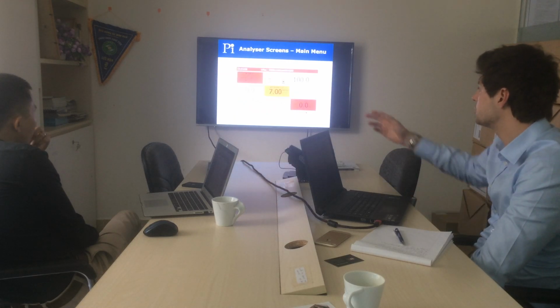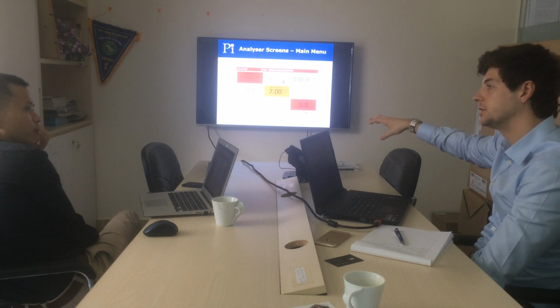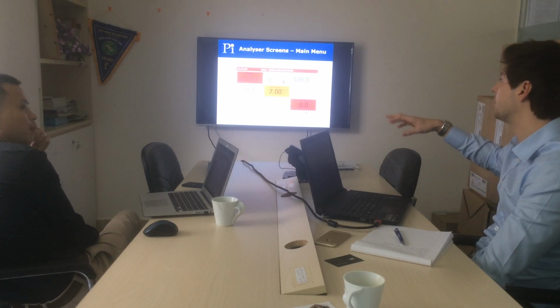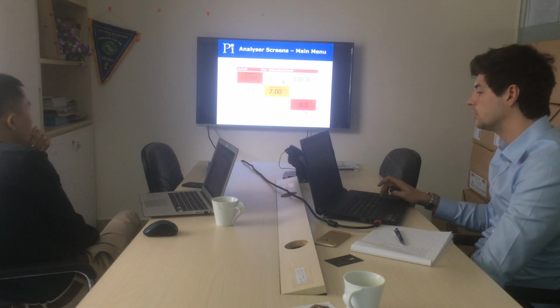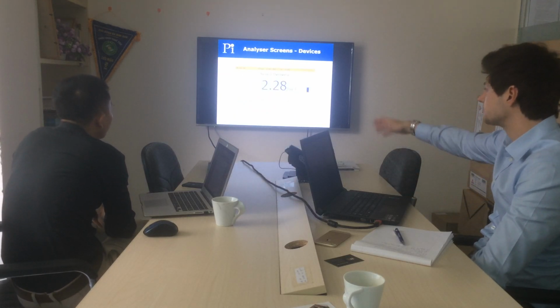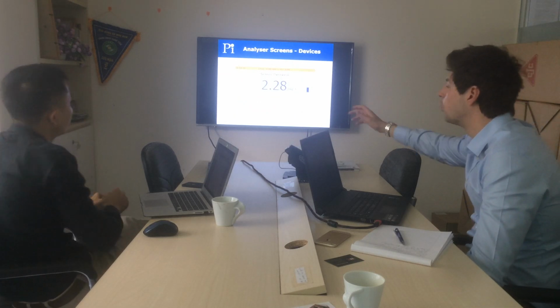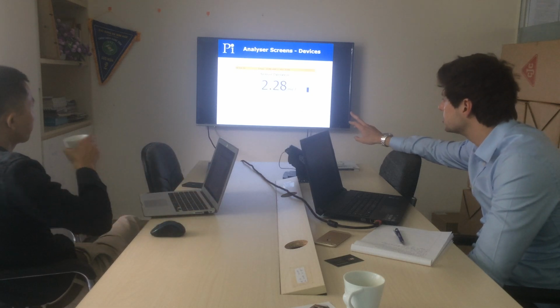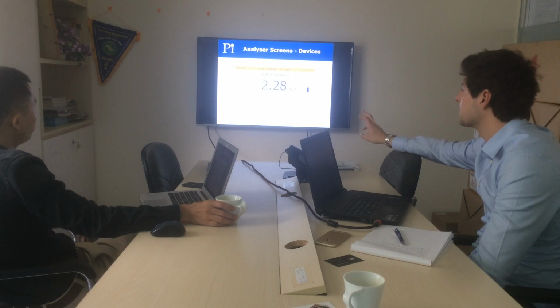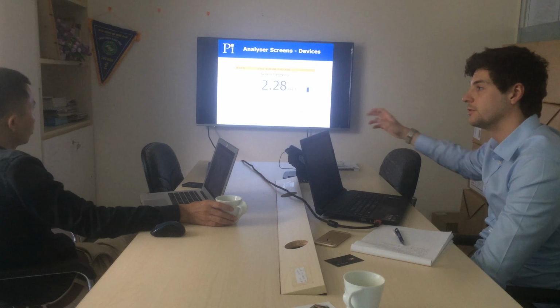And if you click onto a tile, for instance the pH, all of the information is contained in each tile for that section. So all of the information about pH is on the pH tile. If you click on a free chlorine tile, this is where the warning state comes from, because it tells you when the calibration was last done and when it should next be done, and also the maintenance for free chlorine, which is a replacement of some parts.